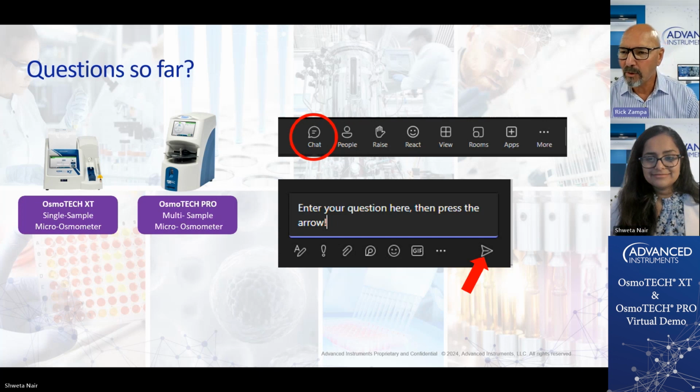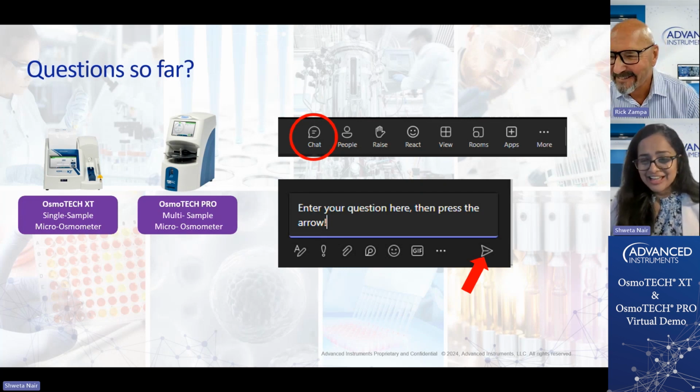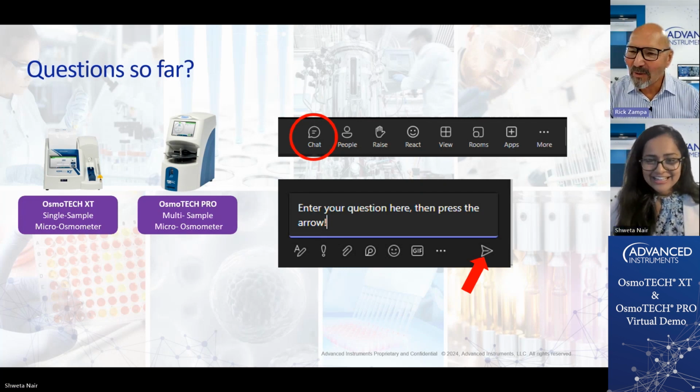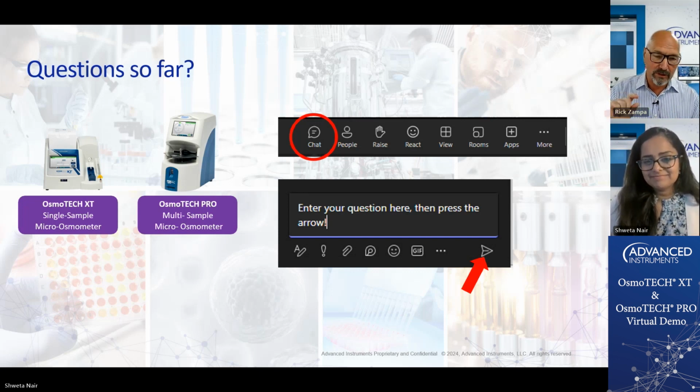First, Shweta, there seems to be one question before we move on. Is there any correlation with sample loading amount to osmolality value? Would you like to take that, or you want me to take that? You can take that if you like. Yes, there is no correlation between the sample volume and the osmolality value. It doesn't matter the volume; the osmolality value should not change with the volume used in the testing.